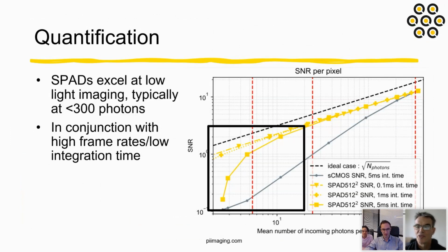Great, thank you. There's a question about why SPAD image sensors are so expensive. I made a joke about this. It's because you need to buy more of those to have a higher volume. Yeah, and quite honestly, I would say that they're not more expensive than the competing technologies that are available to do this level of sensitivity and or gating or speed of acquisition. So the price of SPADs has come way, way down.